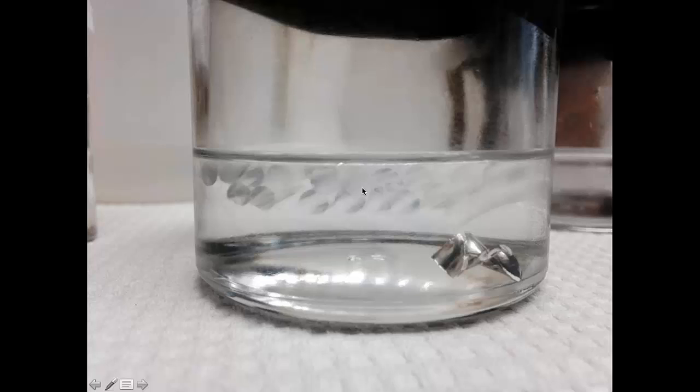And this is so easy that if you already have them clean in the refrigerator, you come in the morning, you put the gel in, run the experiment, and then just collect the RDCs. You've probably already collected the J-scaled HSQC the day before.